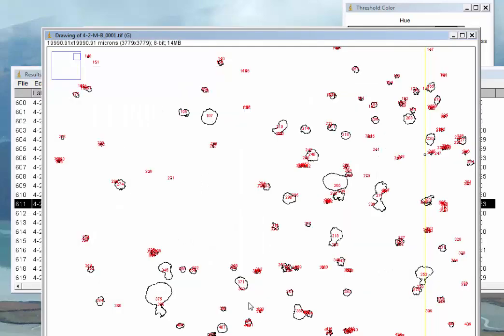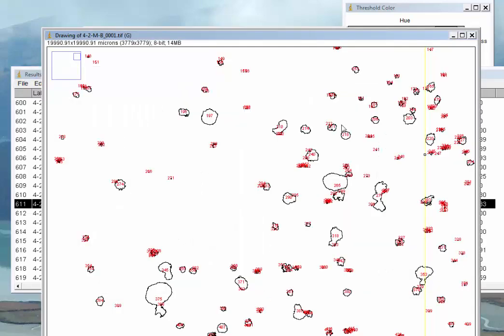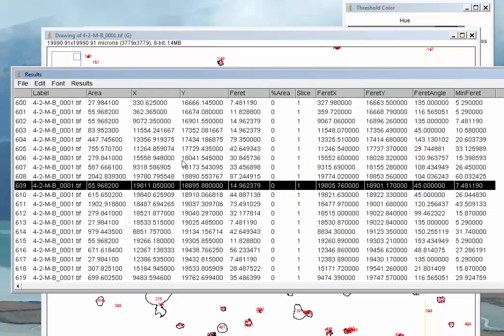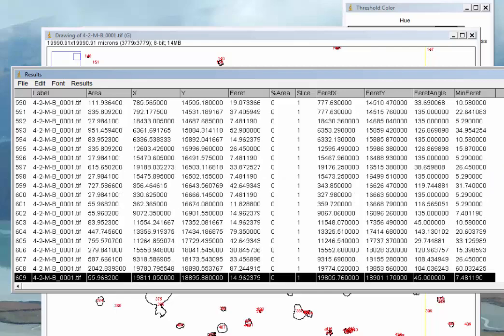If you go through and run this again—I'm not going to do this but you get the idea at this point—you can change your threshold values, and you can save this drawing so that you can compare them. If you don't believe these numbers or you want to get an idea, you can actually look up number 265 here and get the value for it.